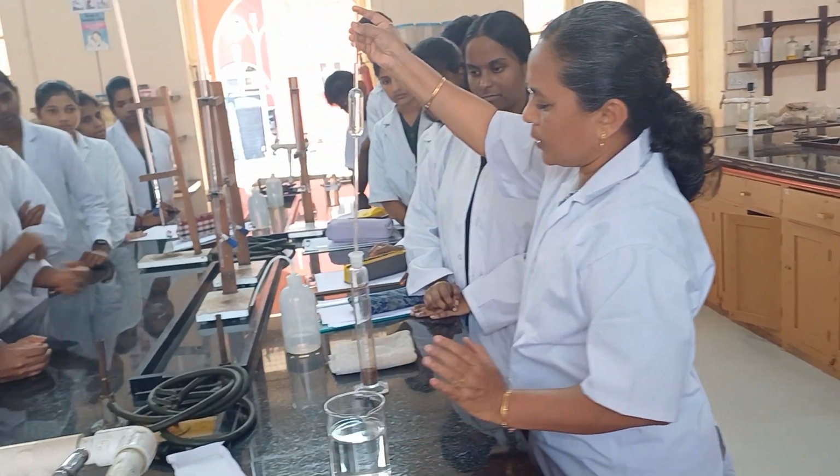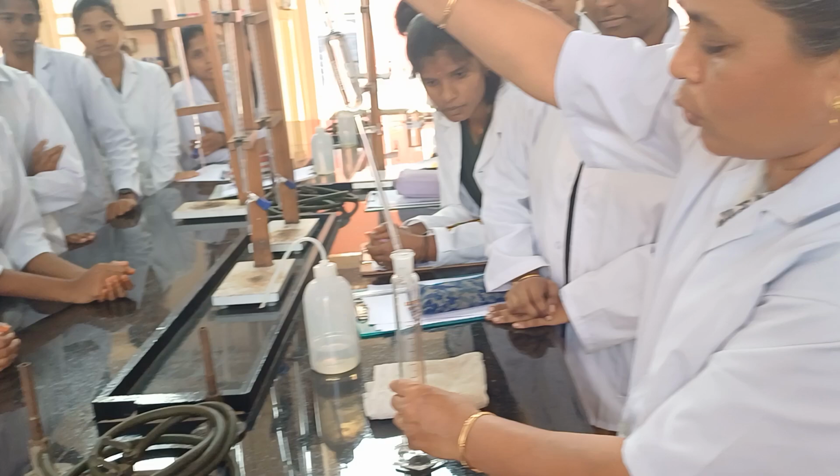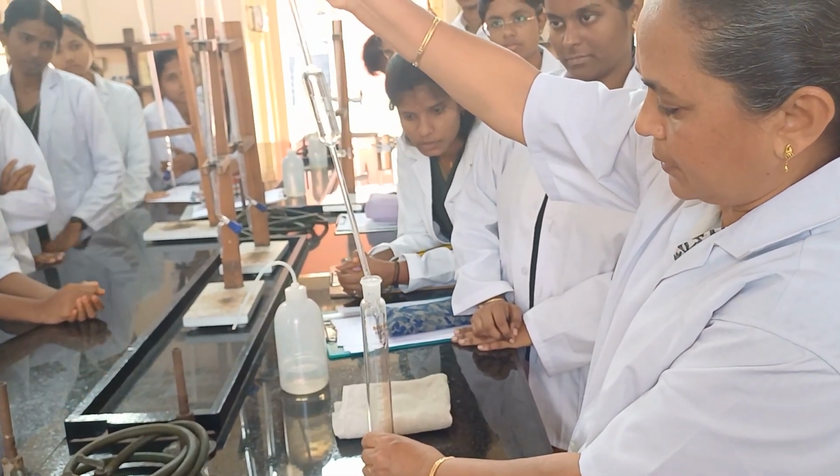The water should be added along the sides. Slowly add the water along the sides of the cylinder.